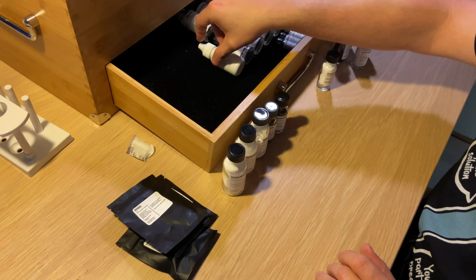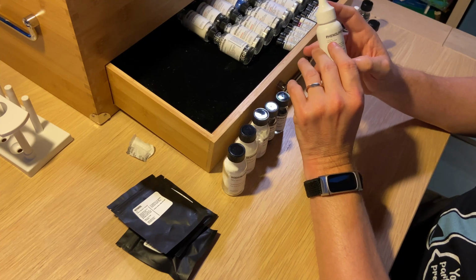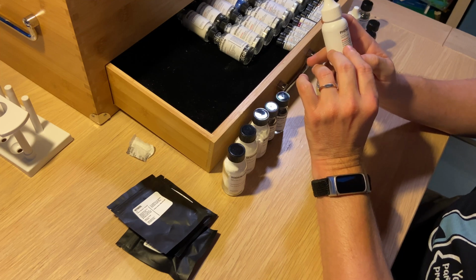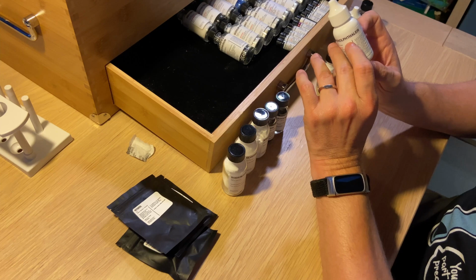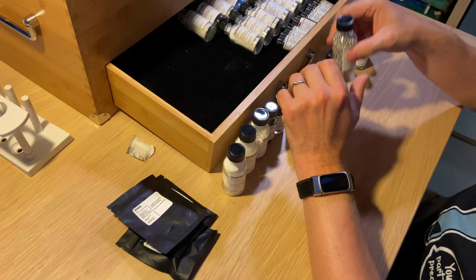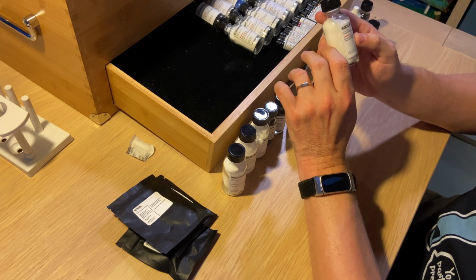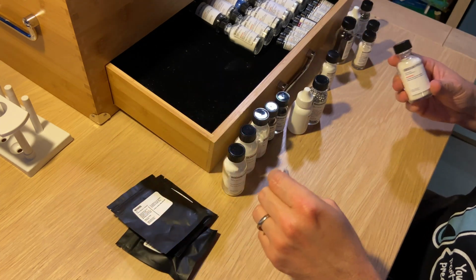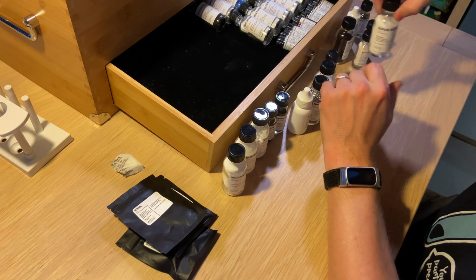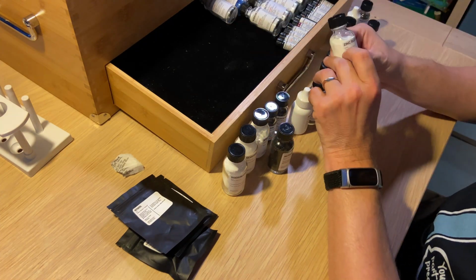Don't mind the clock. We have phenolphthalein, which is apparently suspected of causing cancer, but I'm not sure what you use it for. Interested in what you can do with it. Magnesium. Sodium polyacrylate. Oh, right. No, it's not silicon. We also have silicon in there, I think. Sodium metabisulfite. We have activated carbon. We have zinc sulfate.